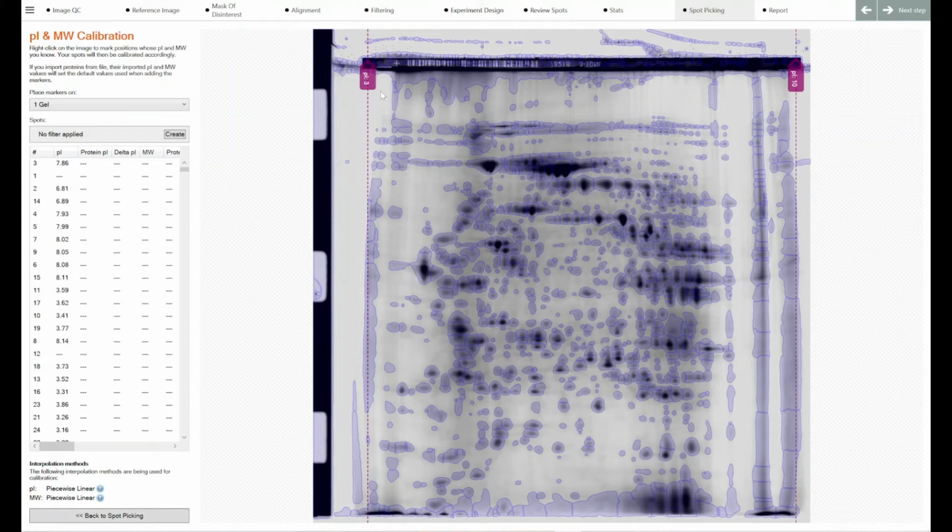Now, as you can see, once I've added these 2 values, and you can add as many as you want, you're not limited to just 2, however, you can get away with just 2. Once I've added this piece of information, the isoelectric point, the focusing point, the pH at which the proteins have no net charge in either direction, positive or negative, you can start to see that the table of results is being filled in automatically.